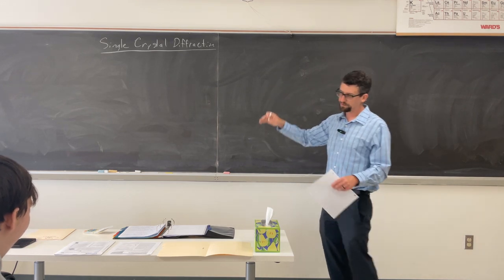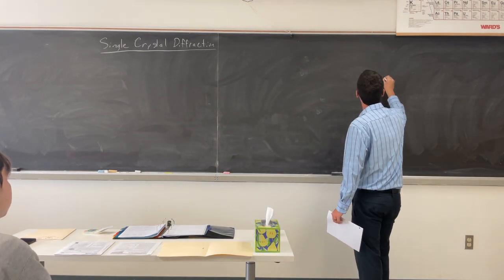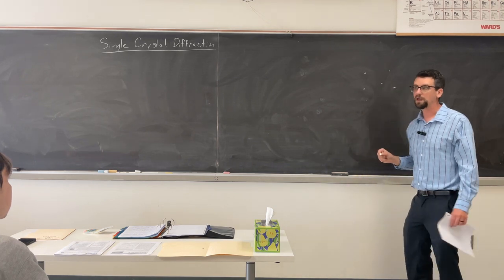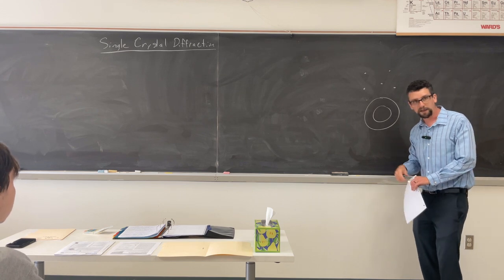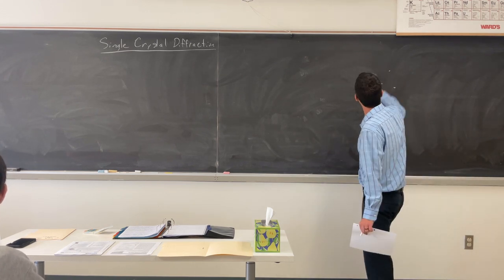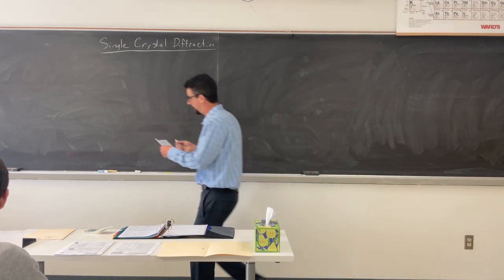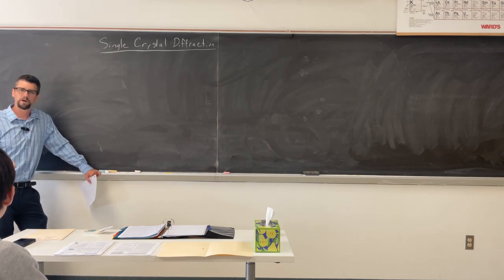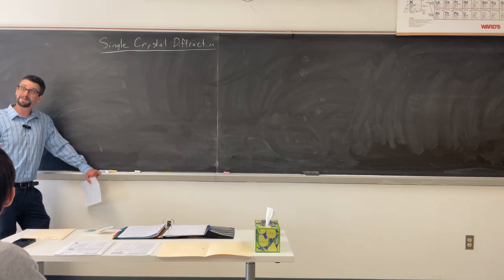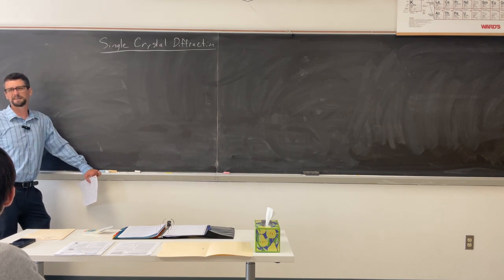If you do single crystal diffraction, you will get points that look like this in the diffractogram. For powder, you get rings. We'll talk about why those things form eventually, but it mainly has to deal with the physical state of what we're talking about. So could you describe to me what is single crystal diffraction? We could talk about a schematic.